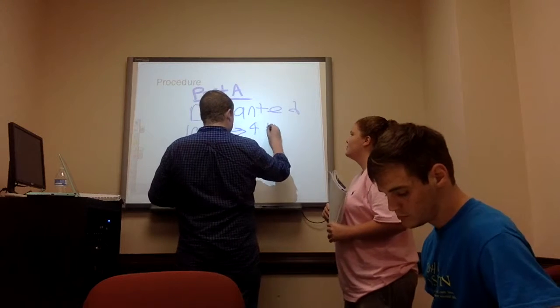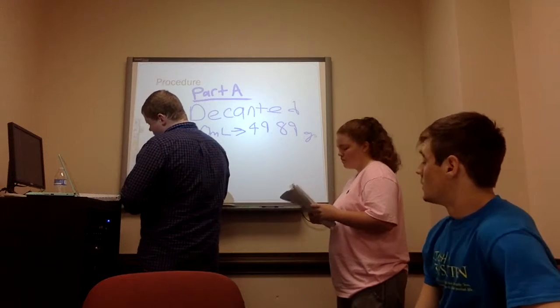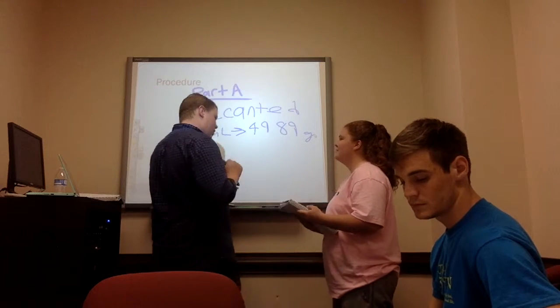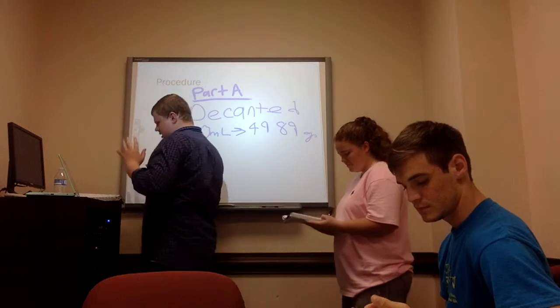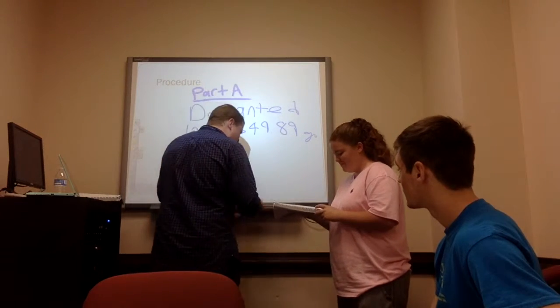49.89 grams. Are you sure that's what you got? I'm 100% confident. You're 100% confident. Yes. Okay, so the excess zinc will stay in its original container, correct? Beaker, but yes. Beaker container. A beaker is a container.